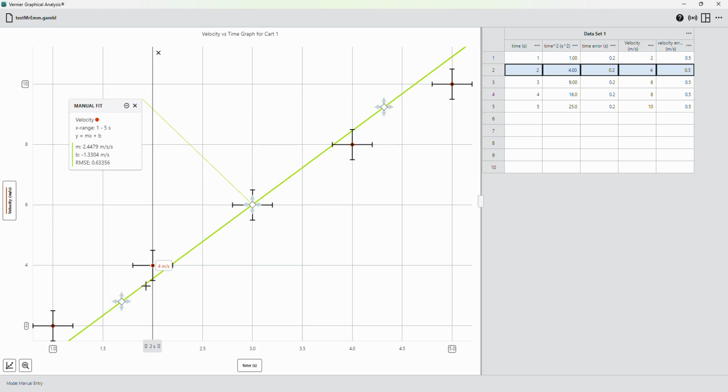So, as I was saying, this part here is touching the edge of that box, and then it crosses through all of the error boxes, the areas of error. Now all I need to do is check that one so that maybe it's there. I can make it a bit larger maybe. Okay, that's the maximum I can go, and I'm happy with that. So here I have my value for the maximum possible slope of this graph, and this is the y-intercept.